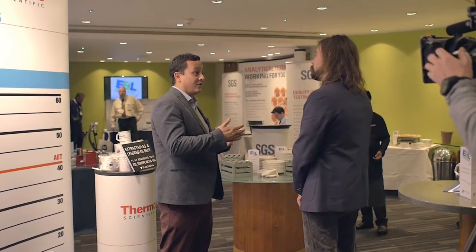Can you tell me a little bit about the unknown aspects of extractables? Well, you're not really looking for the usual suspects. You can do those with targeted analysis effectively. The real challenge is identifying the true unknowns, because they often carry the highest risk. The compounds that you know about, you have already performed a toxicological evaluation. It's the one thing that can end up that maybe leaches into a product 2 years on the shelf, 3 years on the shelf, 4 years on the shelf. So being able to identify those unknowns early can actually minimize the cost during development, or actually the cost of having a drug that's recalled.